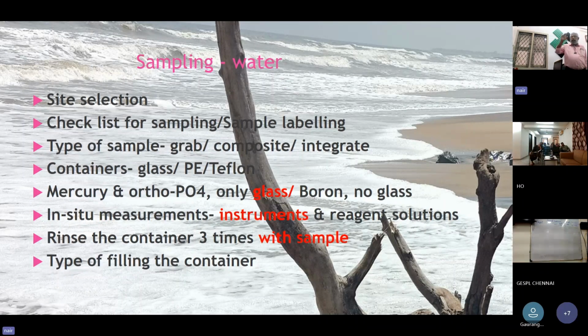Then another thing to be taken care of, the way of filling the container. Some people will ask, this bottle, do I have to fill it fully or take it half full? Yes, if you are going for chemical analysis, you fill it fully. If it is for bacterial analysis, don't fill it fully.